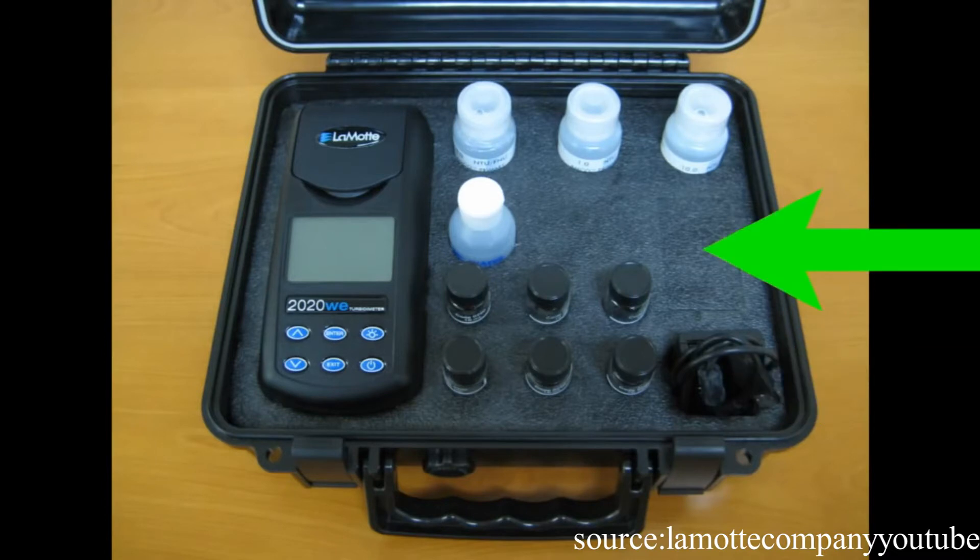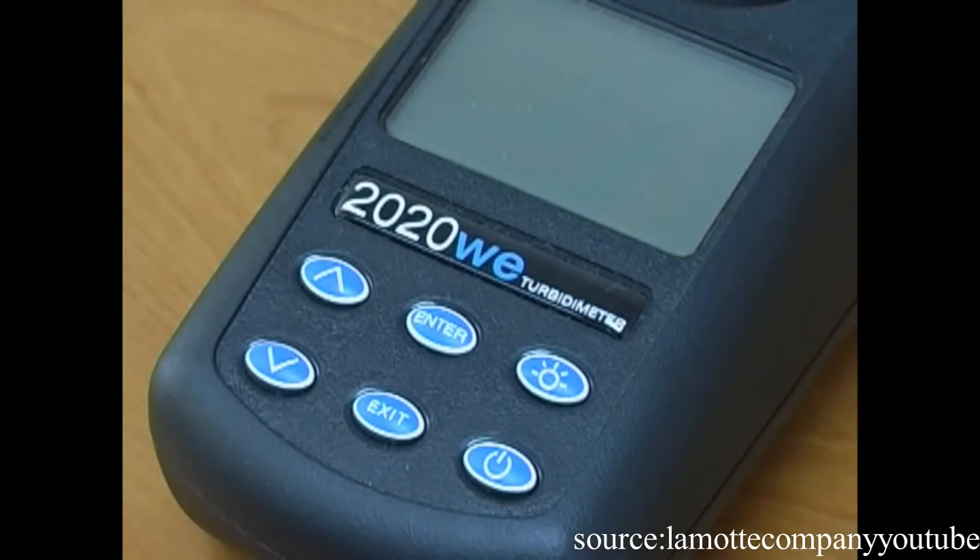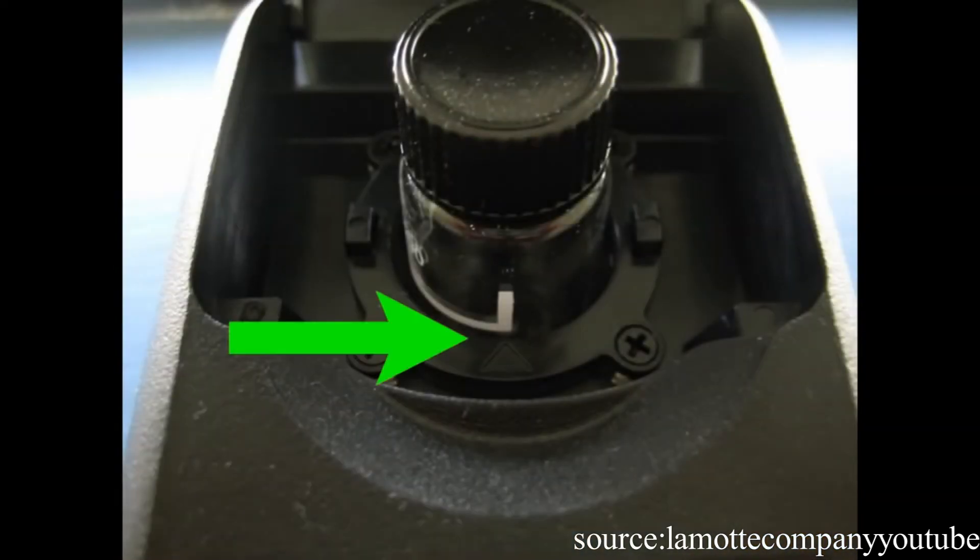Room for optional items such as the car charger. On the meter you will find the power button, the backlight display on and off button, the up and down scroll buttons, the action enter button, the action exit button, and the sample cell holder with indicator arrow.